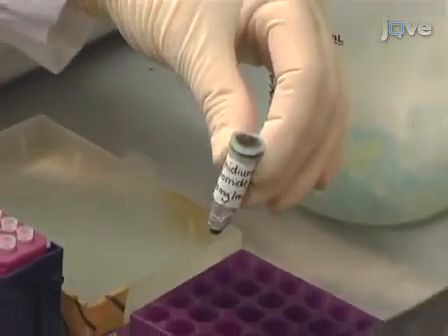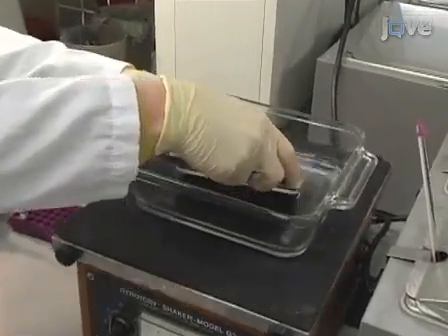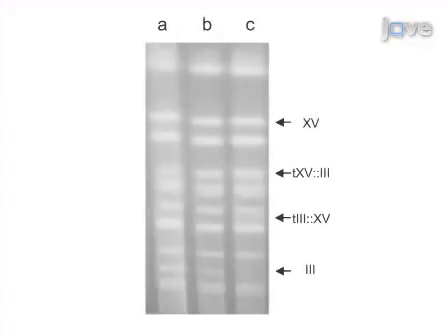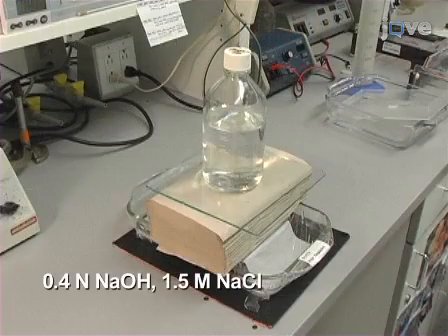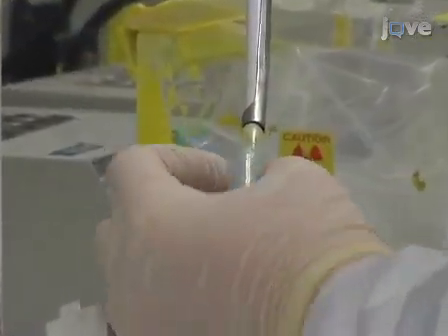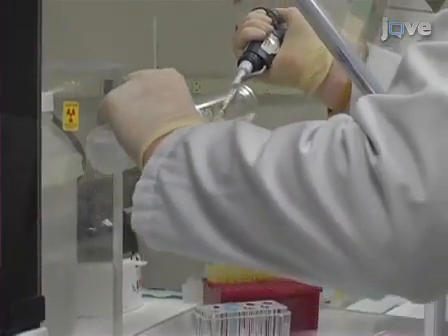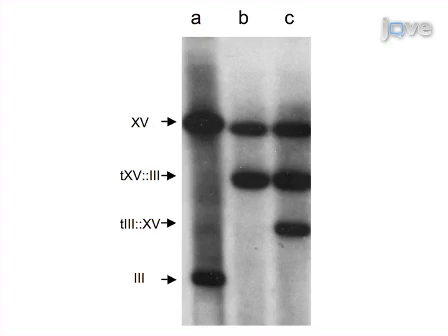At the completion of the electrophoresis, visualize chromosomes by staining the gel with ethidium bromide for 30 minutes, followed by irradiating with UV and destaining in distilled water. Transfer chromosomes to a positively charged membrane by capillary action in denaturing conditions. Hybridize with a P32 labeled probe obtained by random priming with a 1.8 kilobase BamHI genomic clone containing the HIS3 gene. Visualize chromosomes by autoradiography or phosphorimaging.